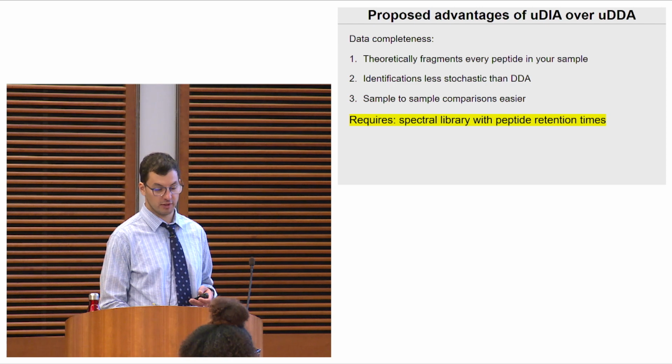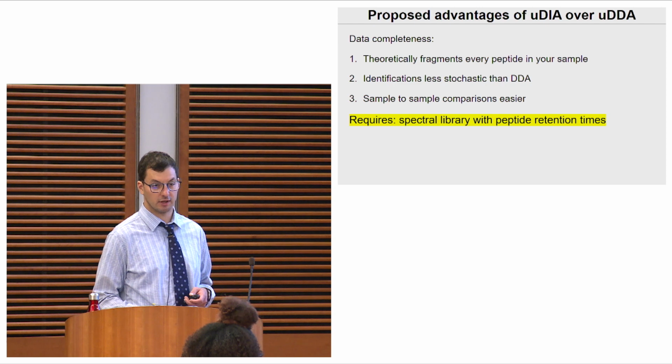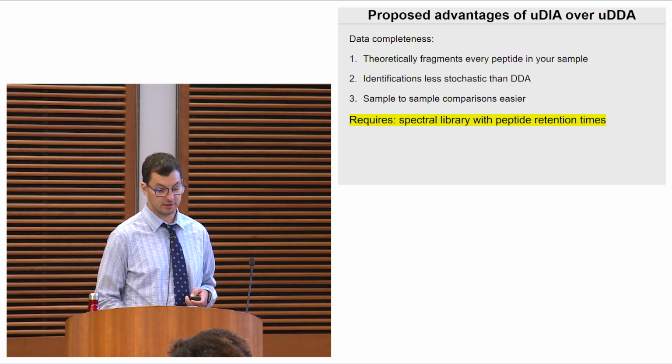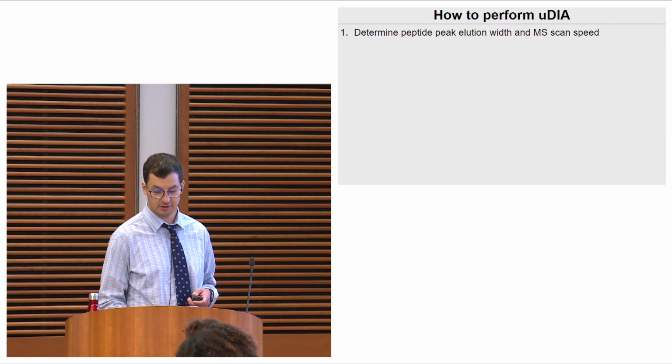For example, there's a library of 10,000 human proteins from the Ebersold lab, and that's really nice if you're working on cultured human cells or any tissues from humans, like plasma. But generally, sample-specific libraries outperform these public libraries at the expense of more data collection time.